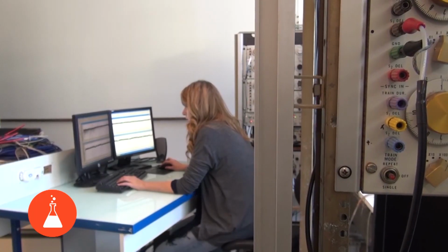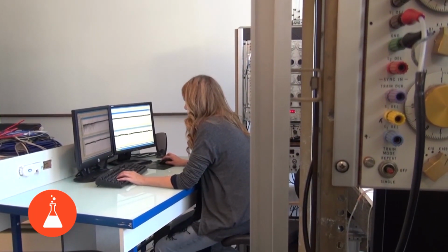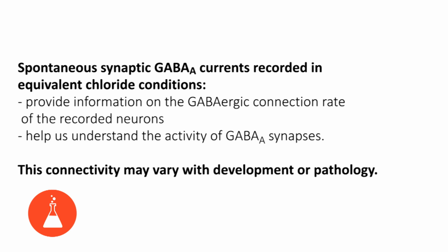In conclusion, spontaneous synaptic currents provide information on the connection rate of the neurons being recorded. These connections may vary with development or pathology.